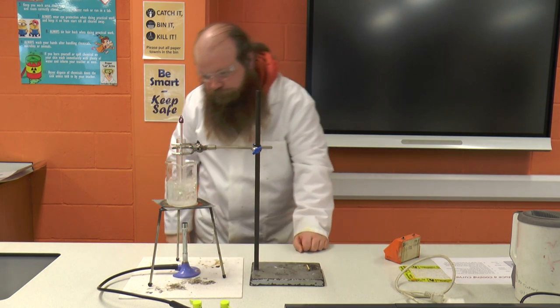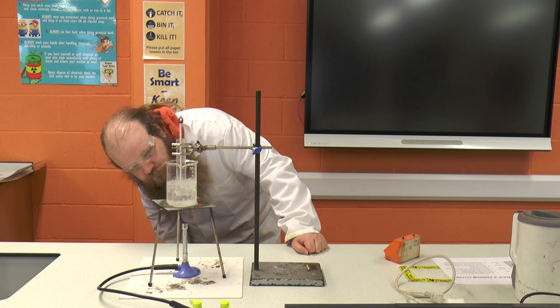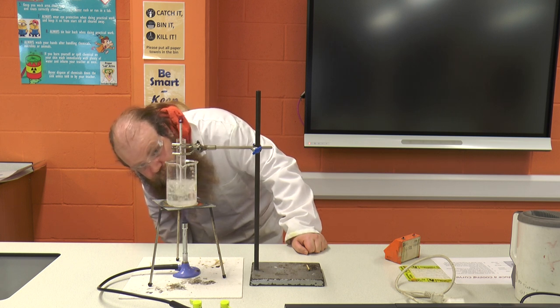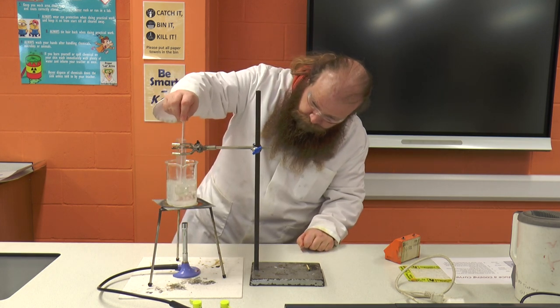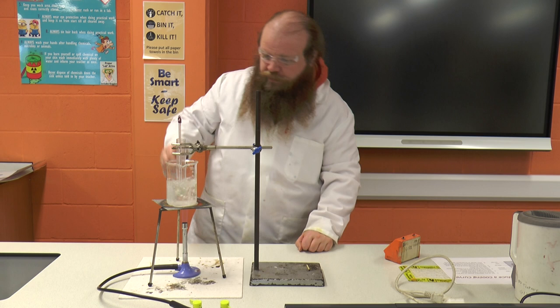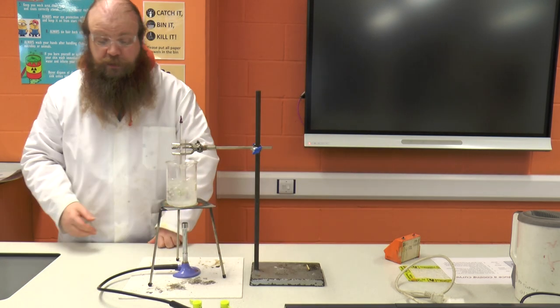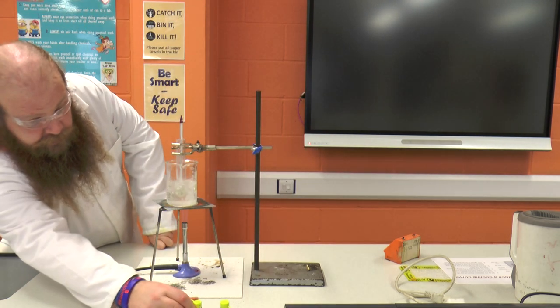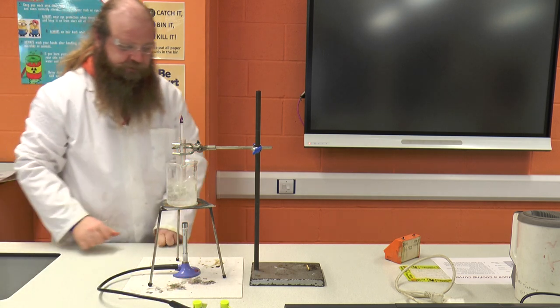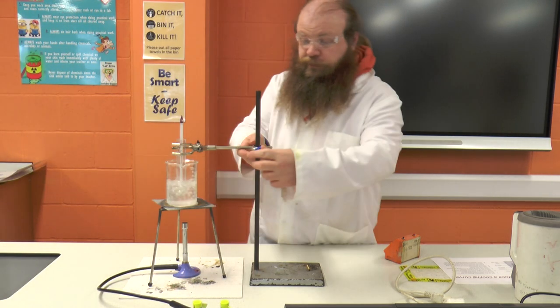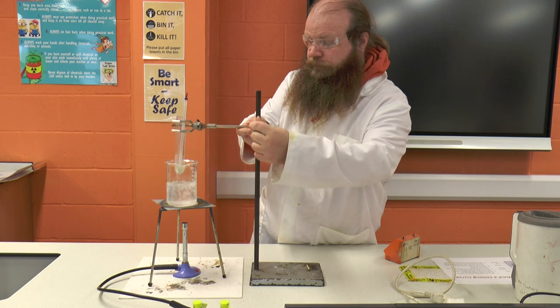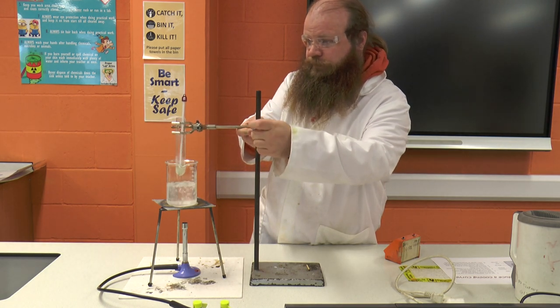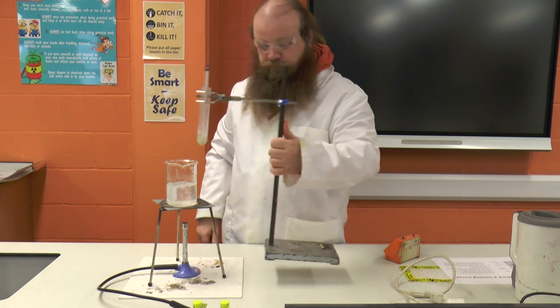There's just a tiny little bit left. Now our solid has completely turned into a liquid. We're going to turn off our gas and then, using the clamp, we're going to raise our boiling tube out of the water and move it away from the hot water.